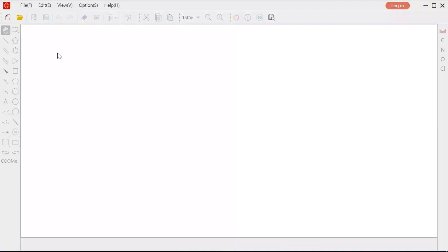Hello, this video is about Kindle basics. Kindle is a useful program for your lab work and study. It is easy to use.